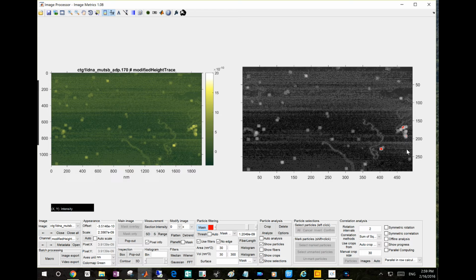So this is not the typical roughness measurement that you use in the other software, where you drag a box and it gives you numbers: the average value within the box and the standard deviation within the box. In this software, when you click standard deviation, you can still drag a box, and you can still draw a custom region there.